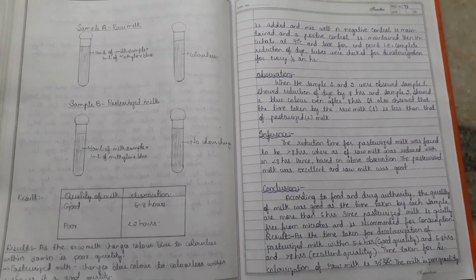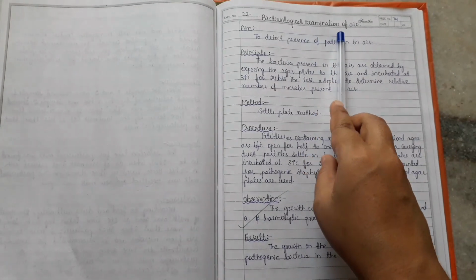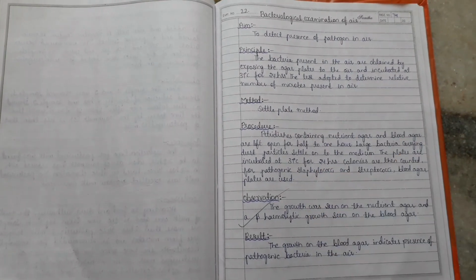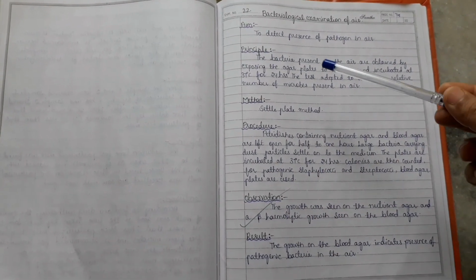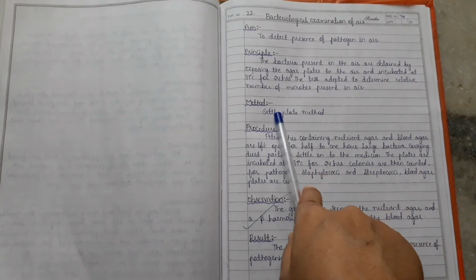So yeah, bacteriological examination of air, to detect the presence of pathogens in air. So this is the principle, this is the procedure. The method we use here is the settle plate method.